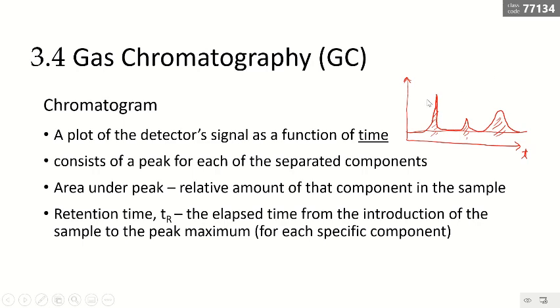So they have their peak, they have their area, and they also have their retention time. In the previous slides, we explained retention time, right? Basically, for peak 1 this is time 1, for example, this is time 2, this is time 3. These times 1, 2, 3 are their retention times. Did you realize I drew the retention time not at the beginning or the end? I try to put it at the center if the peak is symmetrical. Basically, it is the peak maximum point. At that point in time, we call it the retention time.